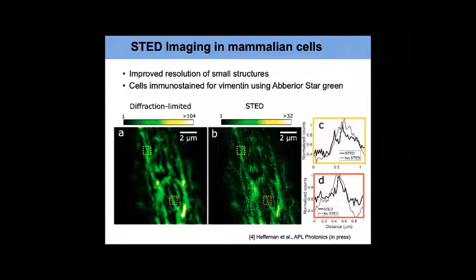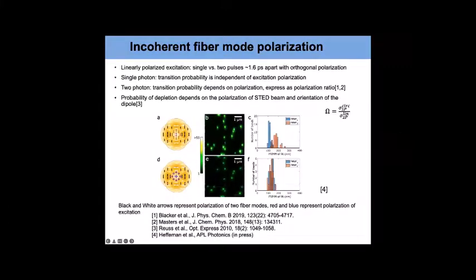Some of the things we noticed happening here: it turns out that the polarization of this donut mode has a pretty strong effect on your STED depletion efficiency.